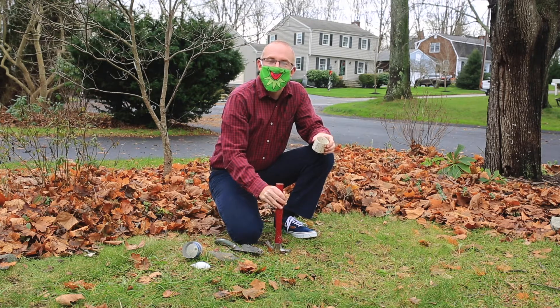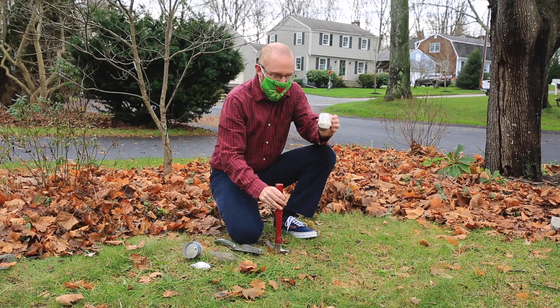Hi, I'm Professor Loren Byrne from Roger Williams University, and I'm going to show you today how we sample microarthropods like mites and collembolans from the soil.